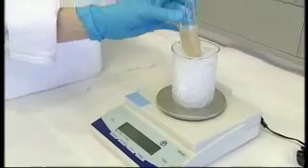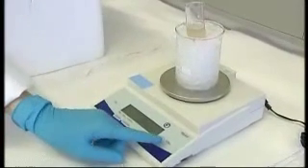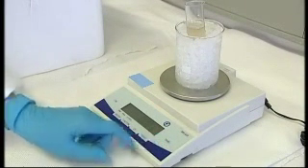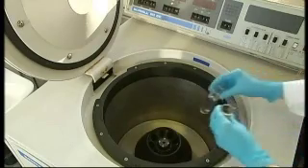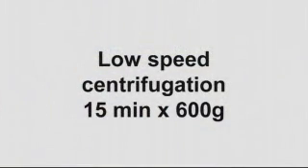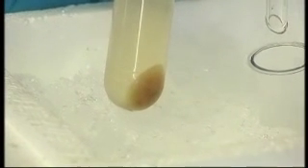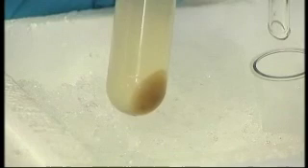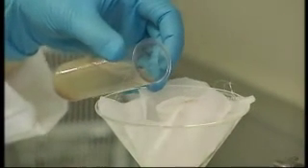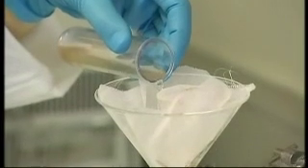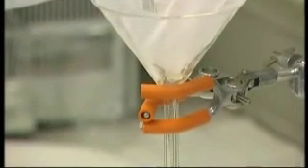Make sure the tubes are equally balanced and do a low speed centrifugation for 15 minutes at 600g. Carefully filter the resulting supernatant into a new centrifuge tube. Try to avoid contamination by the pellet and centrifuge again for 15 minutes at 8500g.